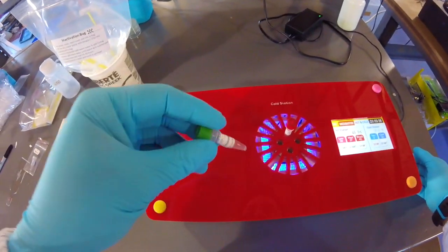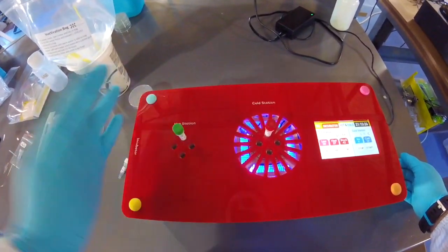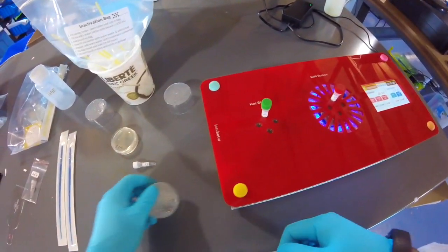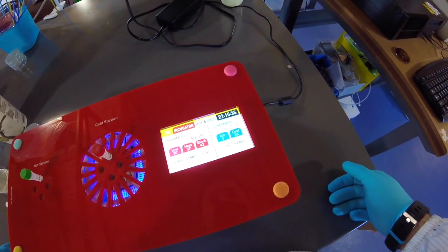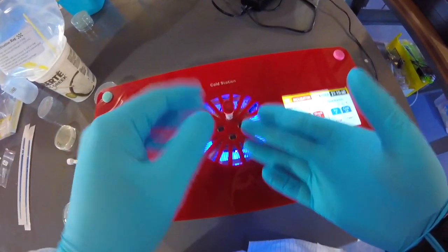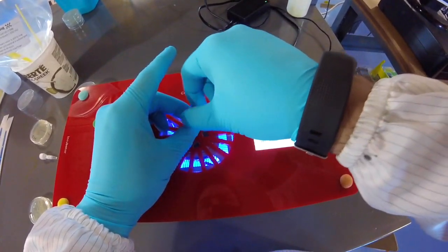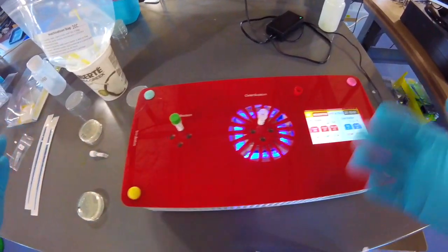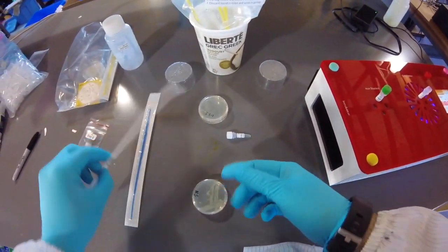I'm going to just put my recovery media tube on the hot station so that it warms up for the recovery step. You don't have to do this, I generally do. And we'll just leave the DNA here. Okay, so once it gets down to 4 or so, between 3 and 4, just wait maybe 20 to 30 seconds before you move on to the next step, and that'll allow the tube to cool down and the liquid to cool down inside of it, all right? I'm going to remove the lid here. It's pretty much the amount of time it takes to get your other stuff ready. So I'm not going to just pause here. I'm just going to move over and move on to the next step.